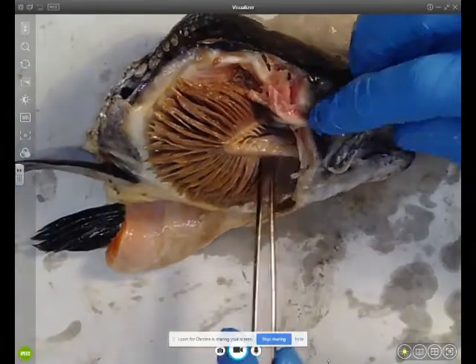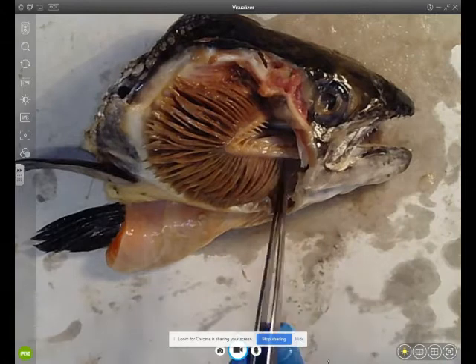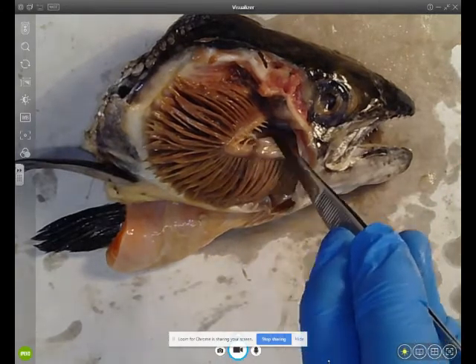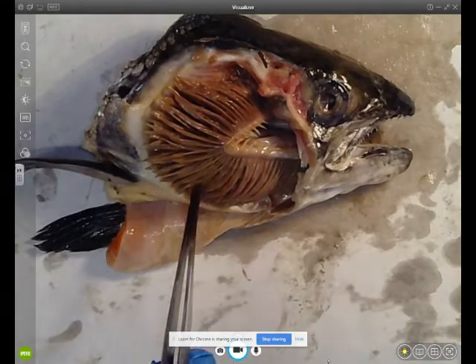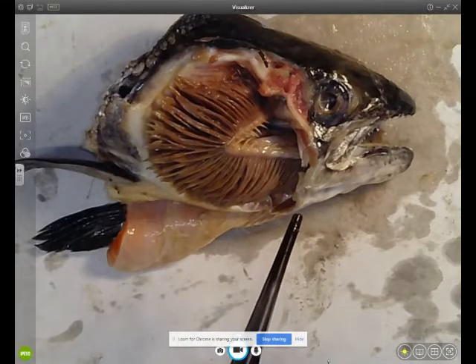What you can see there is one of the gill arches. On the inside is a gill raker, where I'm pointing with my tweezers, and on the outside we have many gill filaments. There are actually two rows of gill filaments per gill arch.